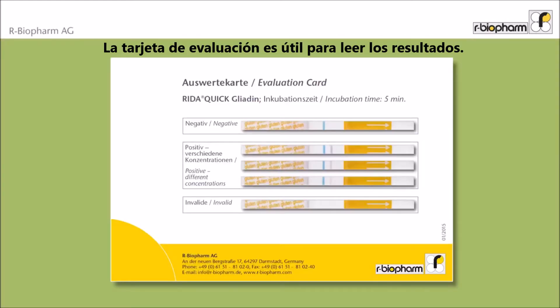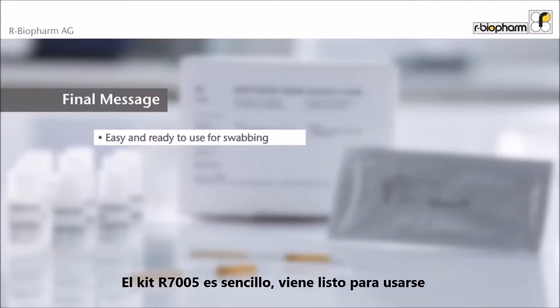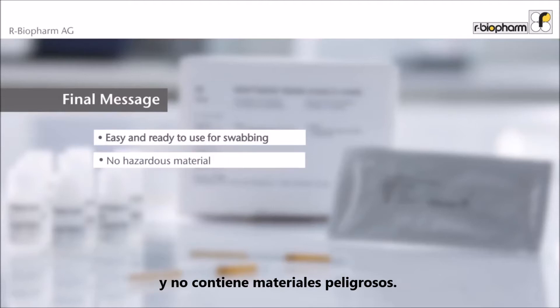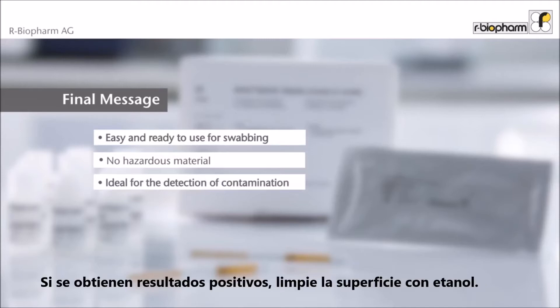The evaluation card helps to read results. The test kit is easy, ready to use, and does not contain hazardous materials. It is ideal to detect gluten contamination by swabbing. If positive results are obtained, clean with ethanol.